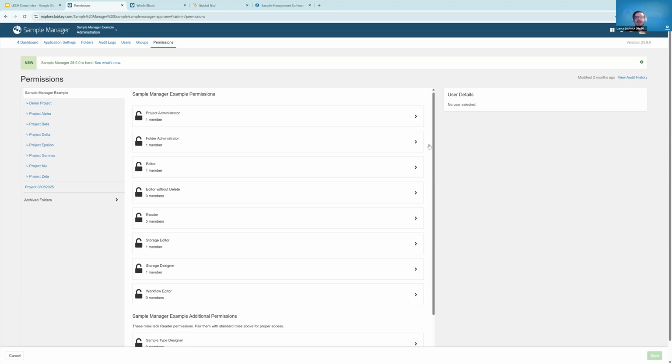We work very closely with you to do that. But if your data needs a little bit more work, it's not as clean as you'd like it to be, if you're not entirely sure of what workflows you want, that process can then take 2 to 8 weeks, depending on how fast you work. We're always waiting on our clients for those timelines because we're really fast on our side. But we have lots of forms that we can help you organize what you want your data to look like, and we know what the best practices are. So our onboarding time is definitely a lot faster than others.